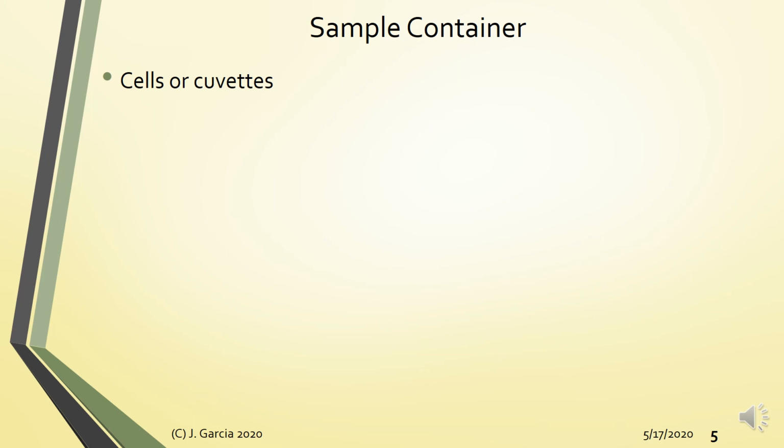to use a wider cuvette, or wider sample cell. And this will give you a larger absorbance response. Usually you want to increase the response because you want to improve the sensitivity of your method. For UV, again, if you remember, there are three types of cuvette: made from plastic, glass, or quartz.